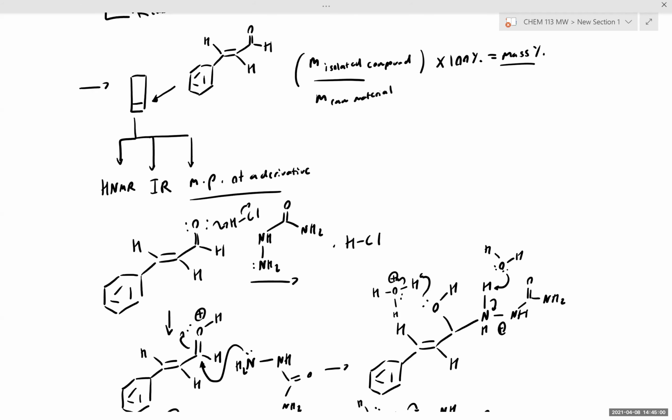Anyway, so to characterize cinnamaldehyde, as with most unstable aldehydes and ketones or liquid aldehydes and ketones, instead, we're going to prepare the semicarbazone derivative and measure the melting point of that derivative.